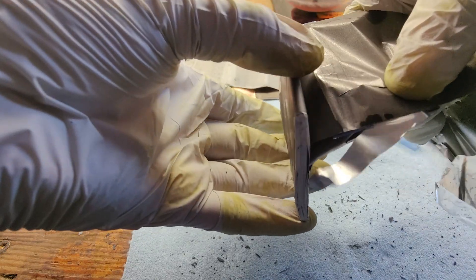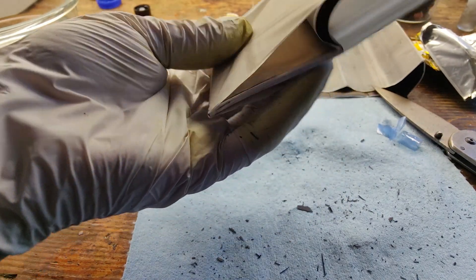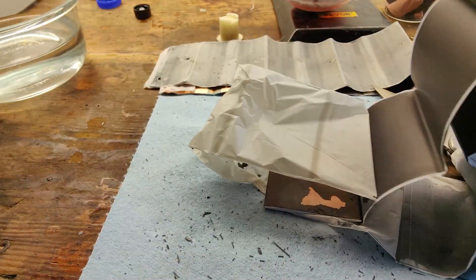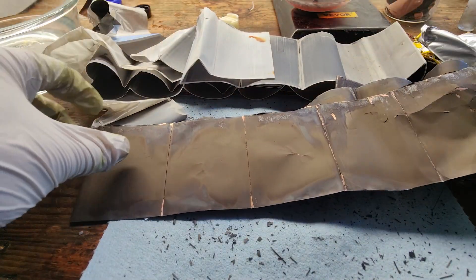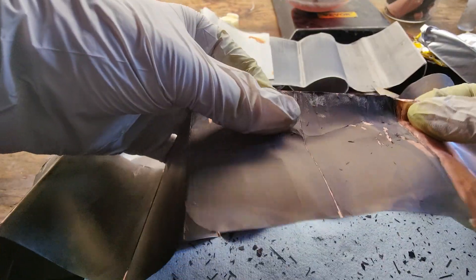The metal oxide, which is the target of the experiment, can come in many flavors, with some incorporating nickel, manganese, iron, cobalt, or a mix of them, known as NMCs. There are several ways to extract the oxides from the cathode; however, I chose to use the acid-base extraction, as it's the only one that I've found that will allow for the extraction and separation of both the cobalt and the lithium.